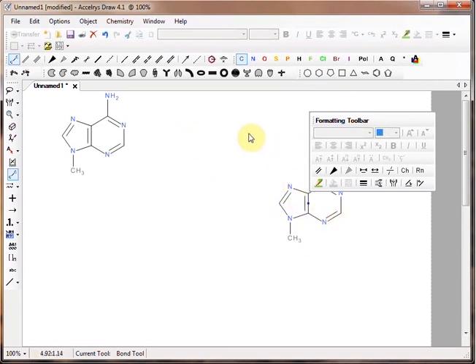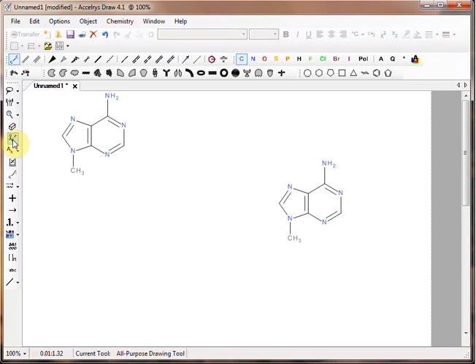I won't carry on and draw out the rest. I just wanted to mention that this all-purpose drawing tool exists and I find it quite useful. The nice thing about Accelrys Draw is it lets you draw things the way you want to draw them. If you don't want to use the all-purpose tool, there are plenty of other approaches.